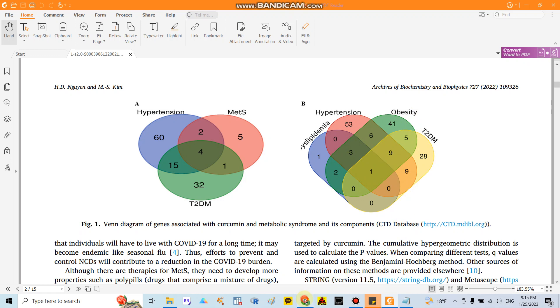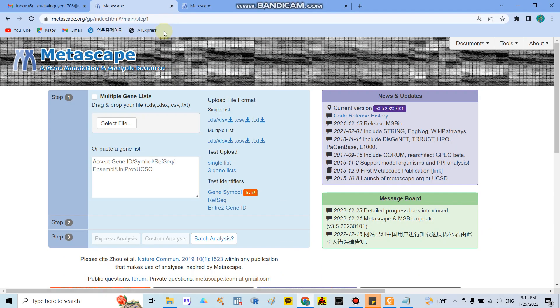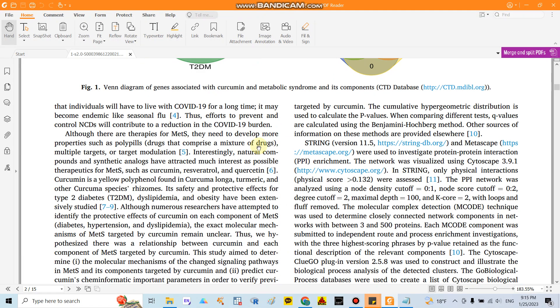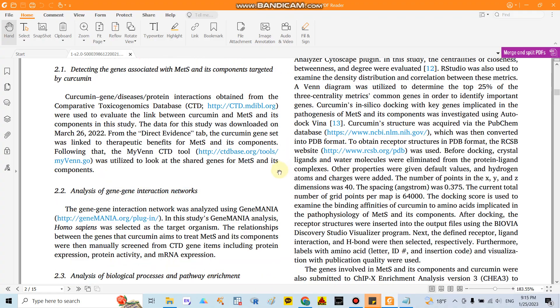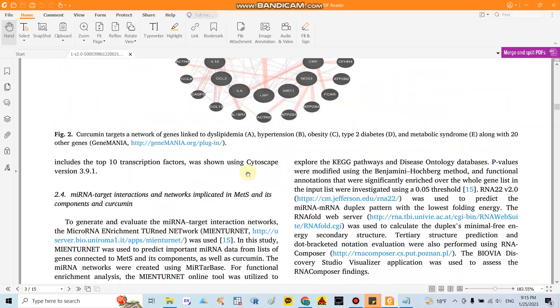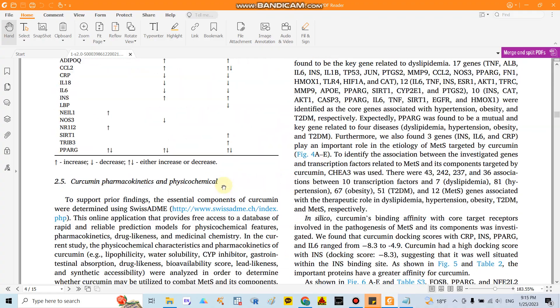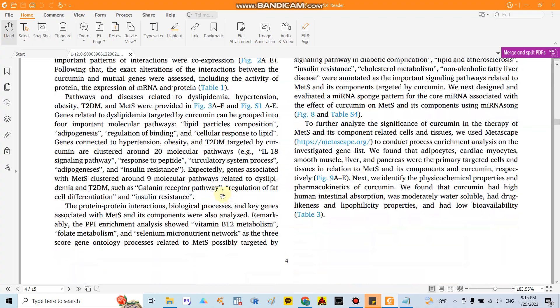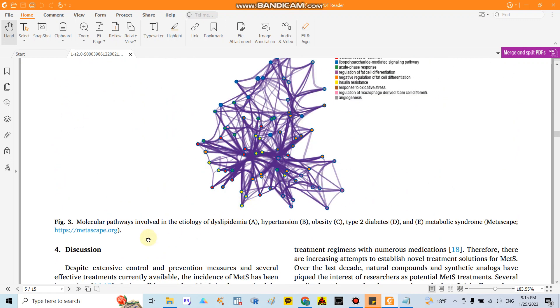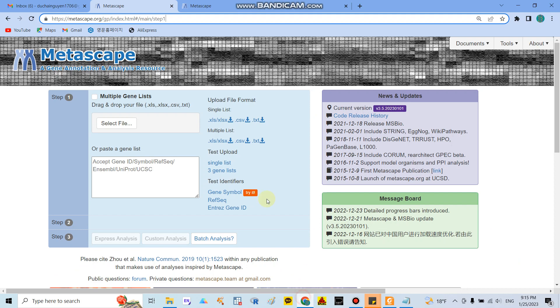So after that you go to the Metascape, you write metascape.org or you can go to my paper in here and you can click the link I mentioned here metascape.org and after that you select the file.